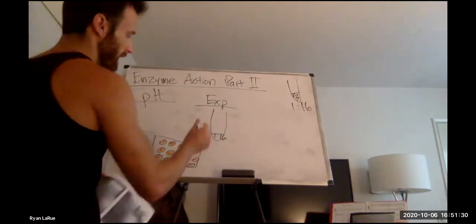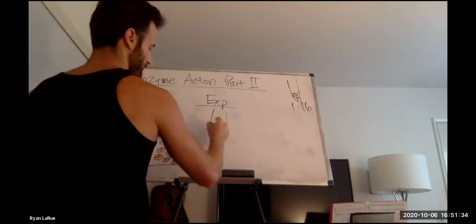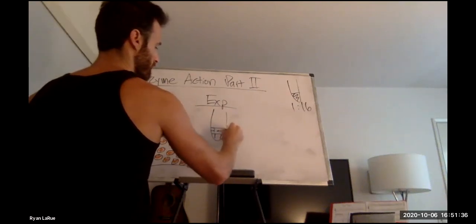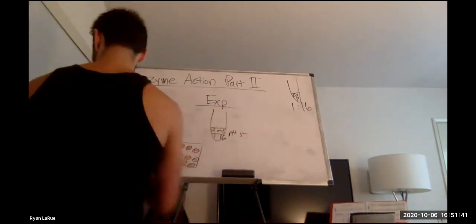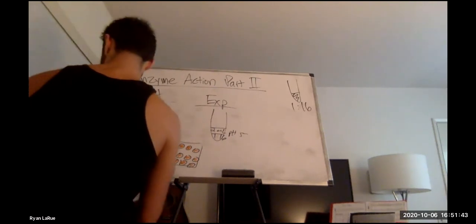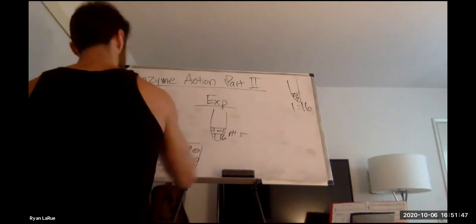You would have your 2 milliliters of pH 5 solution, and this is 1 milliliter, right?